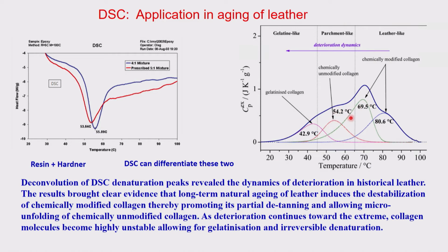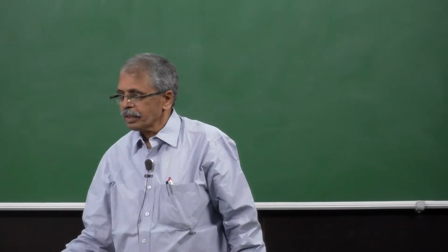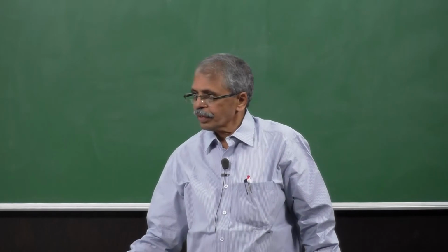So, from that you can tell how old it is, by making some kind of a comparative catalog. So, you will have a standardization. Right now I do not have the standardization here to get exactly how old it is. Of course, approximately in terms of years, or in terms of days, those kinds of things can be identified by going through a standardization catalog, if you can make that.